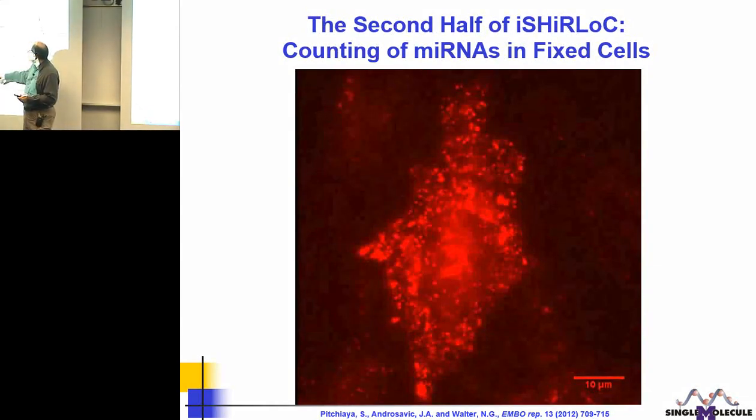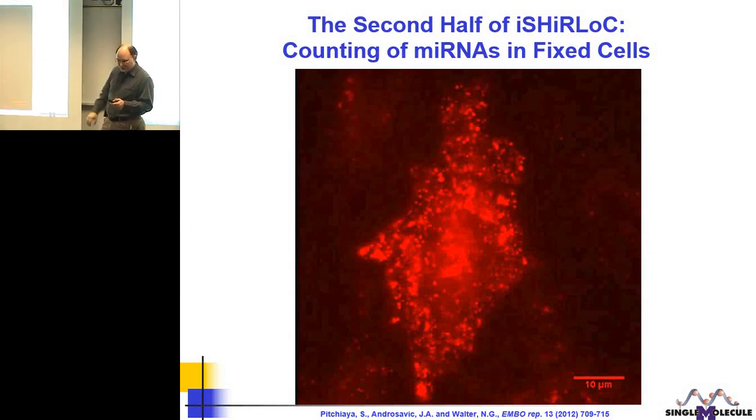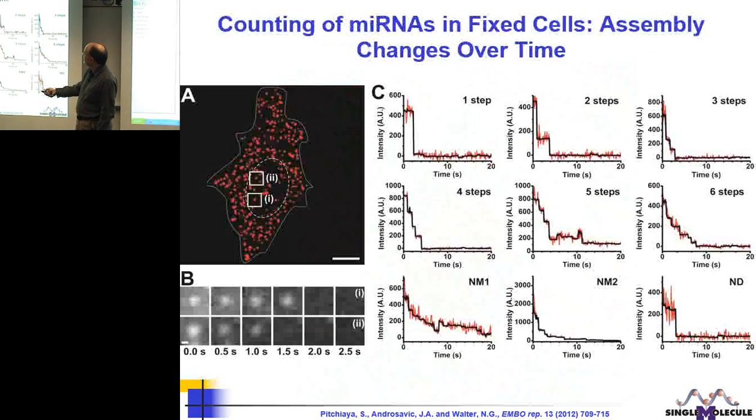You can see that with some of them still. Maybe this plays over. Let's see. Play over. So they kind of are there. And then they either go halfway or they go all the way gone. So it's kind of like a digital switch, not like a dimmer. And again, taking individual particles out of here and then looking at them, the majority actually shows behavior like this one, where this is the particle here, it's there, it's there, there, and all of a sudden it's gone, like a light switch. That will be the signal from it, and it goes all the way to zero very rapidly. The bleaching itself is instantaneous relative to our observation time resolution.